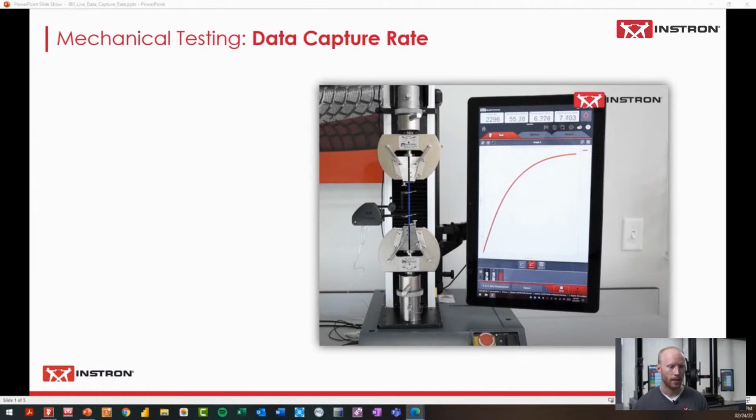Everyone can see the system that's shown in front of us here, an Instron electromechanical single column frame. It's a little bit hard to see, but there is a blue plastic specimen in between these two wedge grips. There's also a clip-on extensometer attached to that specimen, and we use clip-ons here at Instron to measure the deformation, essentially the change in displacement, of that plastic specimen or any other material you might be testing.